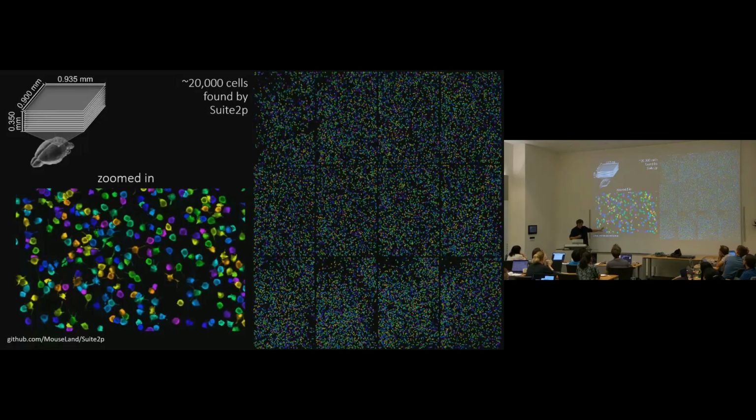Okay, this is what we're trying to get. We're trying to get a set of masks, which essentially all we're going to do with is multiply them with every single frame of our movies to extract our fluorescence traces. So if you wanted to, you could weigh all these pixels equally, and it would literally be an average of the pixels inside the masks. But we want to take into account the fact that some pixels are very dim, either because they're in the nucleus or maybe on a dendrite. So we want to weigh those less because they have less signal. So they're still positive weights, but it's a weighted average of the pixels inside that ROI. And that's by and large going to be our extraction method once we find these ROIs. It's not going to be anything more fancy than that.